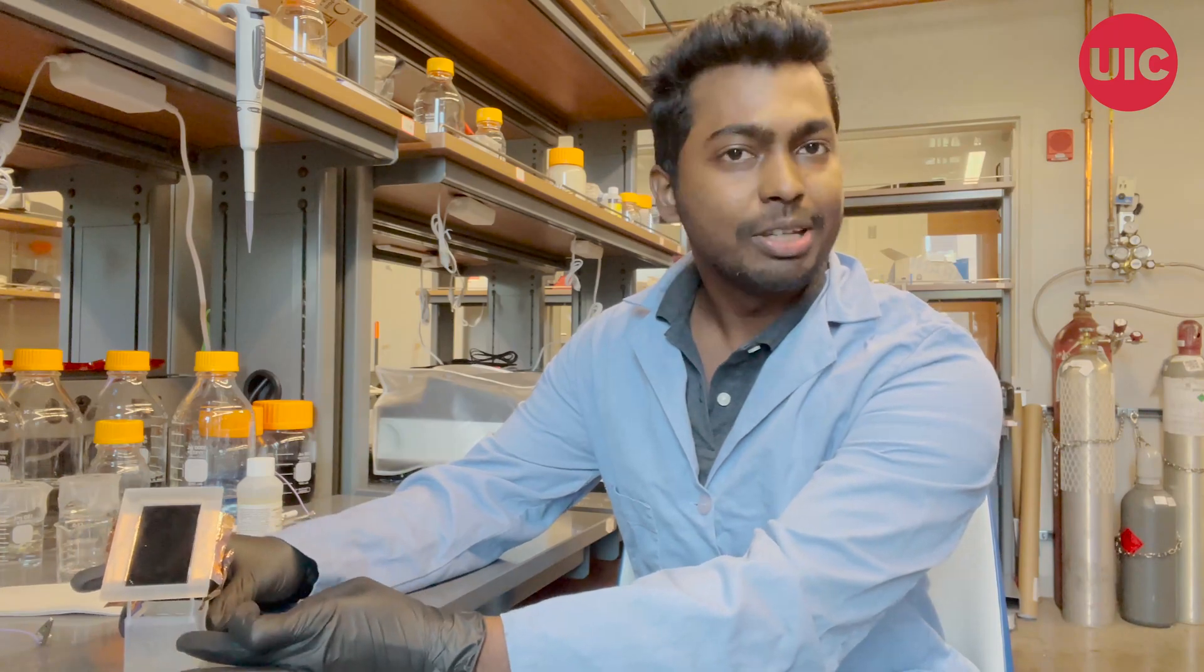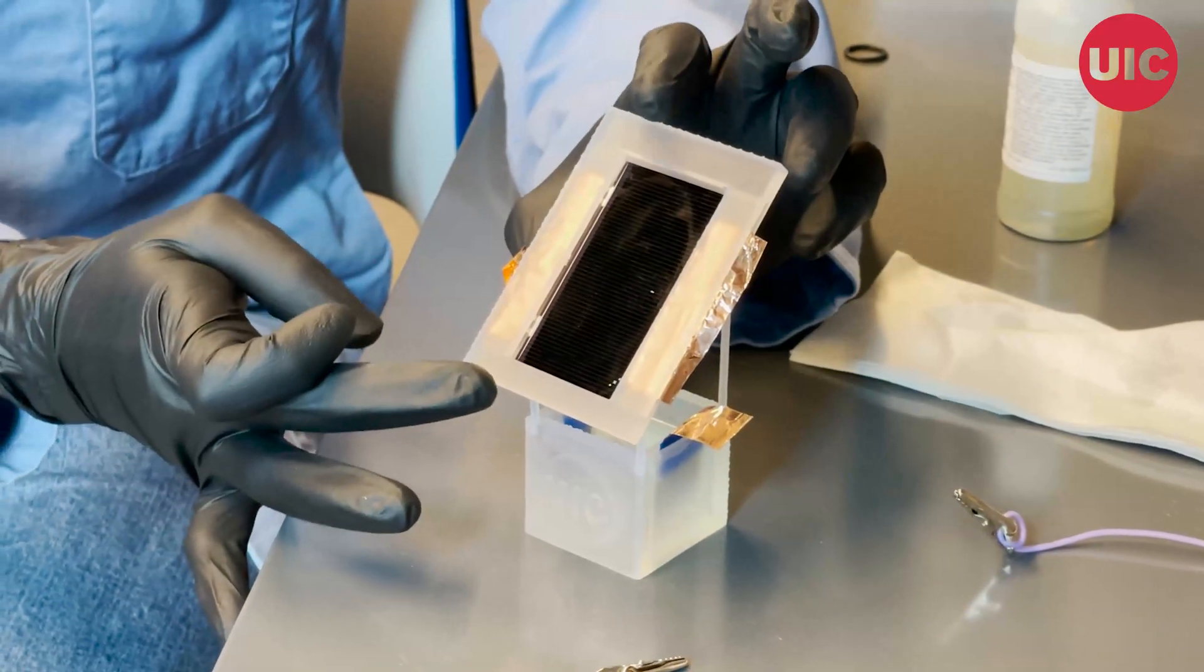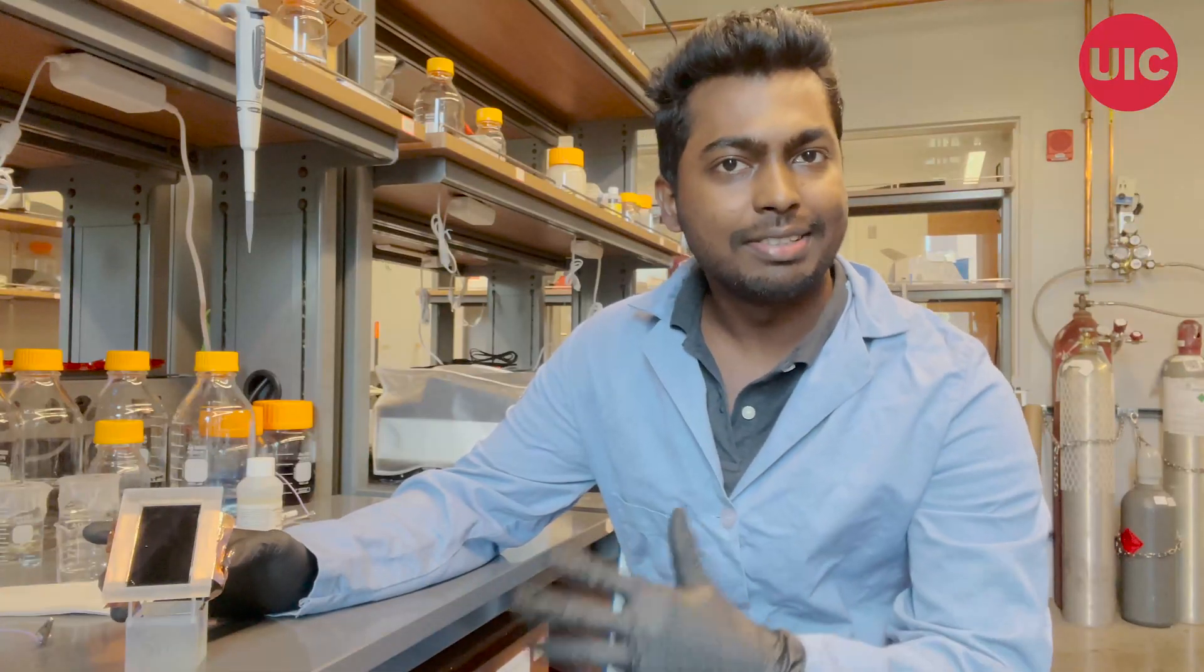Hi, I'm Nishitan and I'm going to demonstrate how this device works. This is our electrochemical cell and this is our solar cell. The electrochemical cell has two different electrodes: cathode and anode.